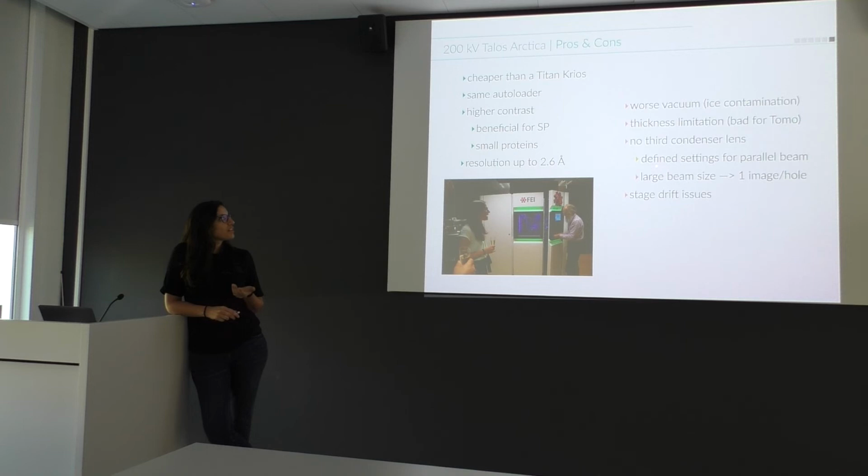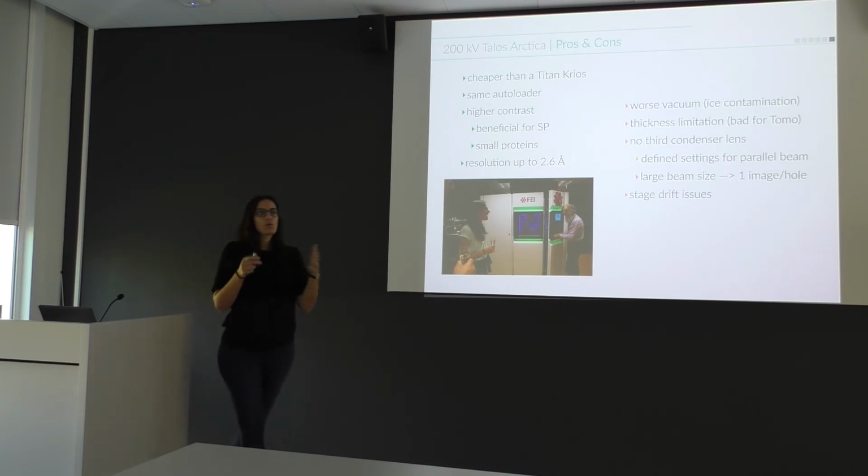And the fact is, we spent quite some time at the beginning when we installed the microscope at Groningen to really check every little thing of the microscope and find the best settings, and I'm working with small proteins, so at a certain point you have your best settings. Once you found them, we're basically not changing anything. And if you don't change so much, it makes your life easier. So it's a disadvantage which you can turn into an advantage.